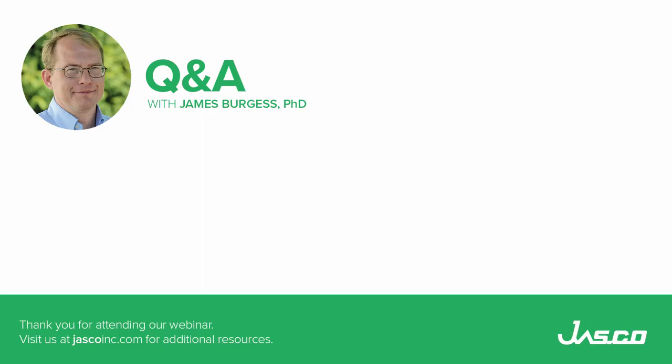On what basis does the software run chemometric analysis? Not sure. Carlos, you know that one? I think the question is based on which algorithm is being used, and actually you talked a little bit about that. JASCO software has the suite for chemometrics with 5 different algorithms. The ones that you showed are CLS, PLS, PCR, PCA, and MCR. So we have different algorithms to do the chemometrics. I hope that I answered the question.